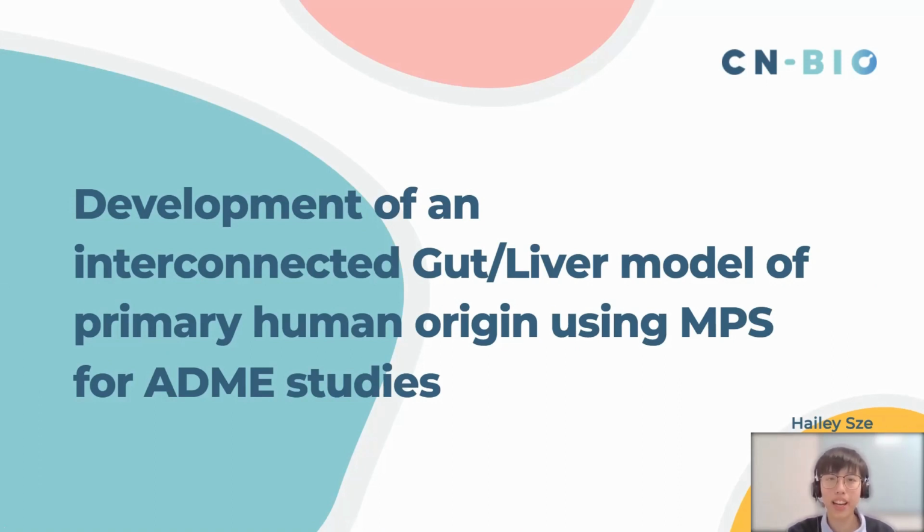So, my name is Hailey, and I am a scientist working at CN Bioinnovations. I'm really excited to be here today to talk about how primary cells could be incorporated into gut-liver MPS models for application in ADME studies.